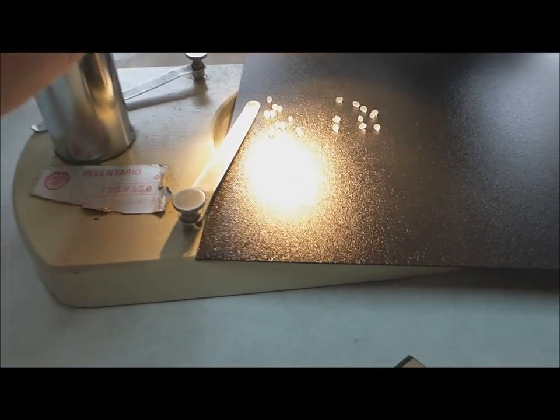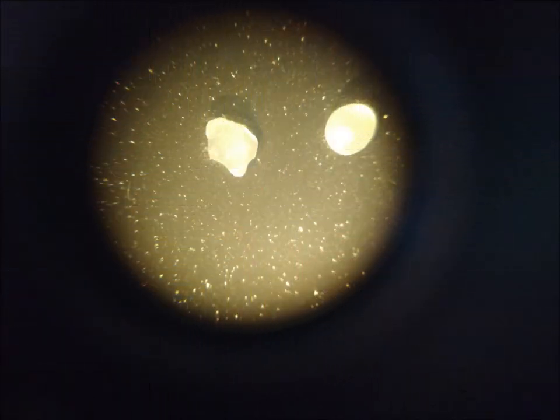We can see the two parts of our microcapsules. The pancreatine core will be darker than the wrapper.